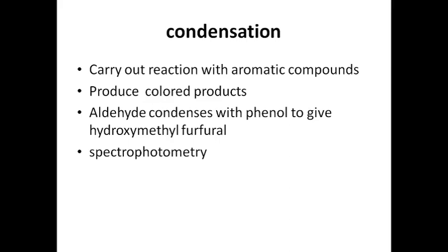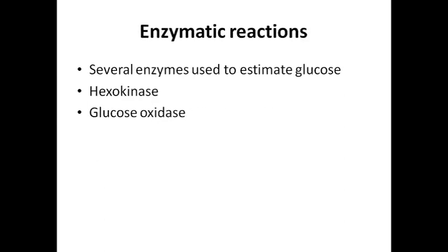Also with some aromatic amines like o-toluidine, to give colored compounds. These colored compounds can be estimated by spectrophotometer.